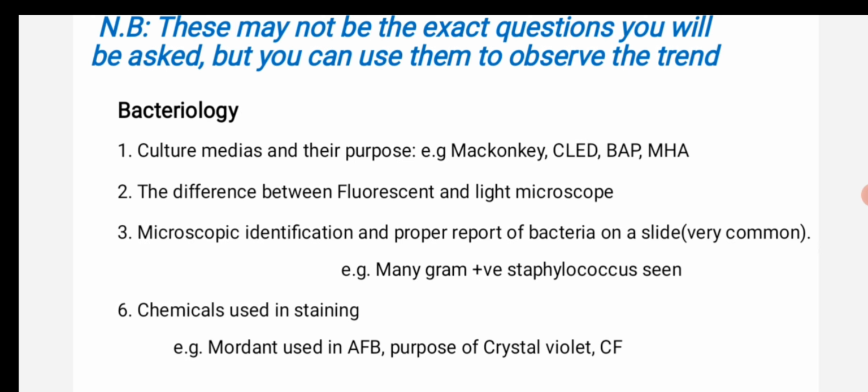In bacteriology, the most common thing is that we will be given culture media, and we may be asked to identify them, which kind of culture media they are, and also their purpose. We may be given culture media such as MacConkey. We have to name the culture media and state its purpose.